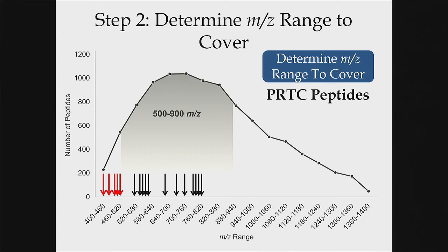mass to charge peptides. So what I usually see is I have fewer peptides per protein, but the actual quantitative signal for those peptides is better. So it's, do you want fewer peptides with better signal or more peptides with a little bit noisier signal?